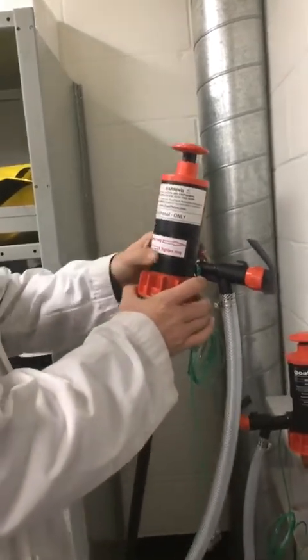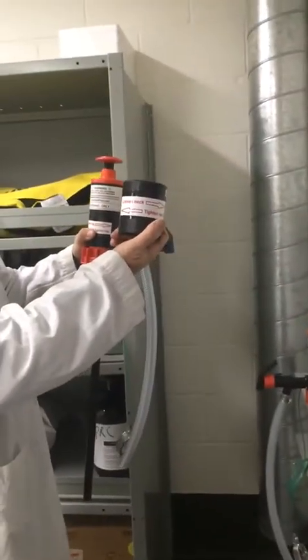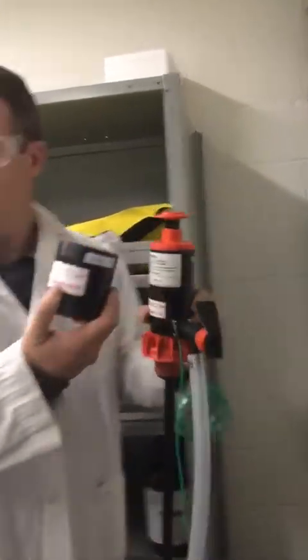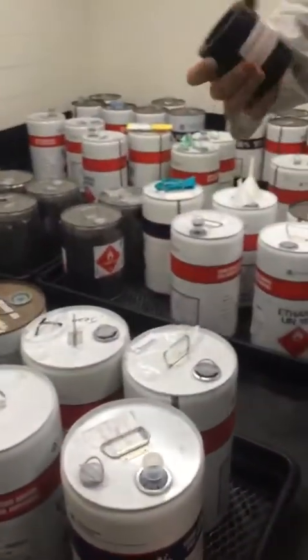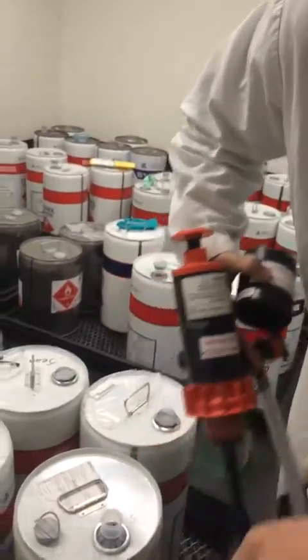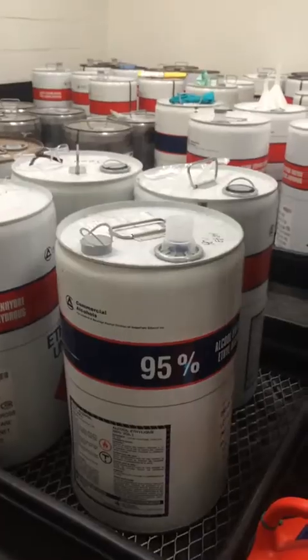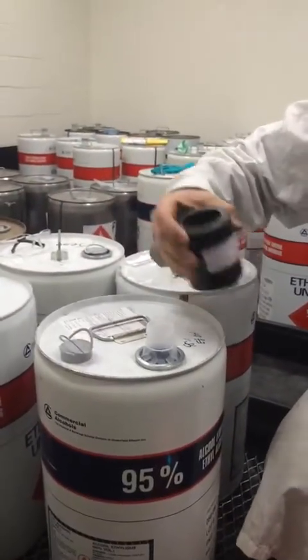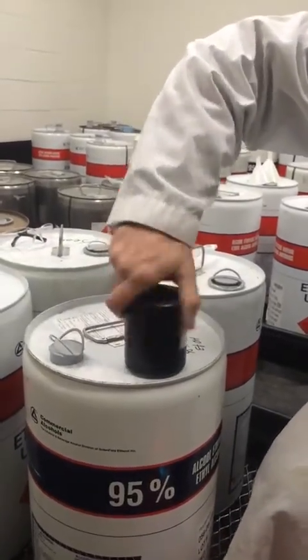In order to use the pump, you grab one and you also grab the adapter neck — these are the two things you'll need — and you proceed over to your drum. You'll notice the drum is also labelled 95% ethanol; they have to match. The first thing you do is put the adapter neck on your extended pour spout, place it over the pour spout, and turn clockwise until it's snug.